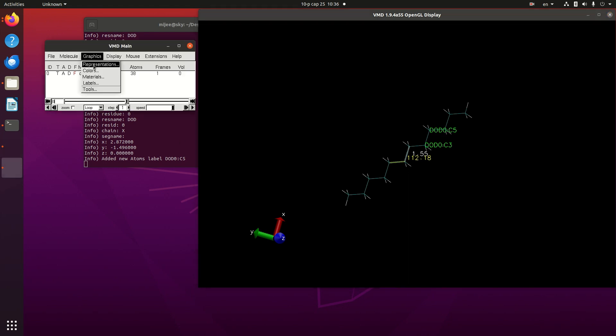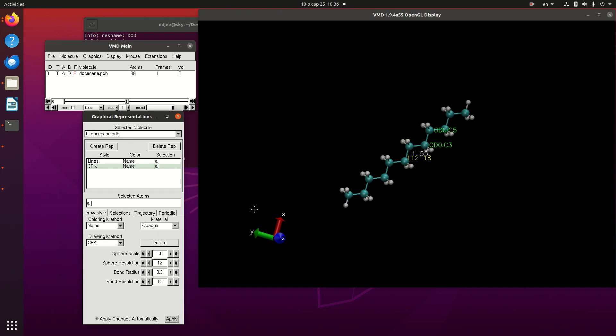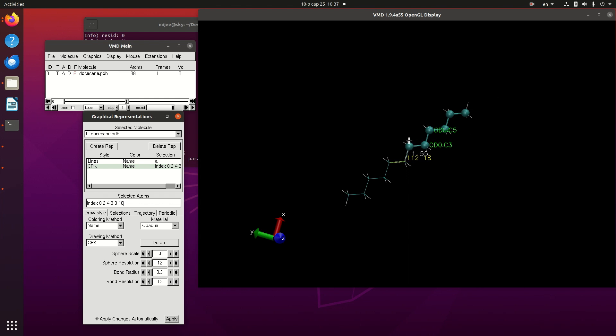Index is 0, 2, 4, 6, 8, and 10. We selected this side of carbons and another one is these hydrogens.